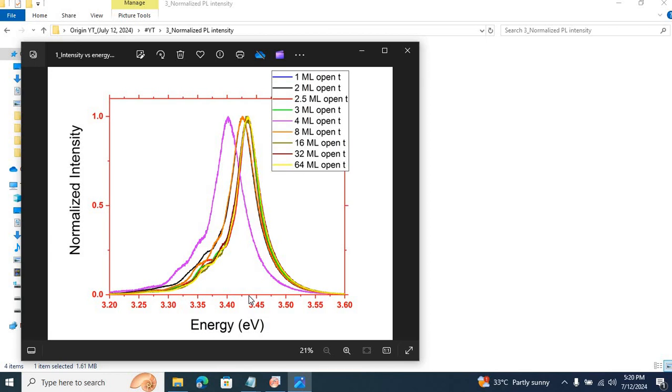So why is the peak position important in photoluminescence measurements and also in X-ray measurements? Because the peak position tells you about the crystallinity and about the type of the sample, and a shift in the peak position either to the left or to the right tells you about the compressive and tensile forces in this film, or in other words the stress and strain inside the thin films that you have grown using different growth techniques. So it is crucial to look at normalized peaks as well.